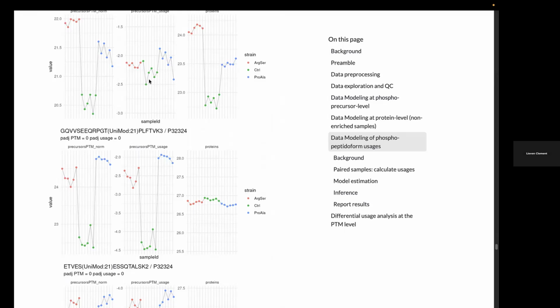That's what I mentioned. It's a super clean sample. And then you have to think about normalization, or you have to go back to the researchers. That's something that often bothers me with public data. You often see these pathological cases, but if you consult the technicians or the researchers that gathered the data, they often know why it is, but you cannot get it from the metadata.